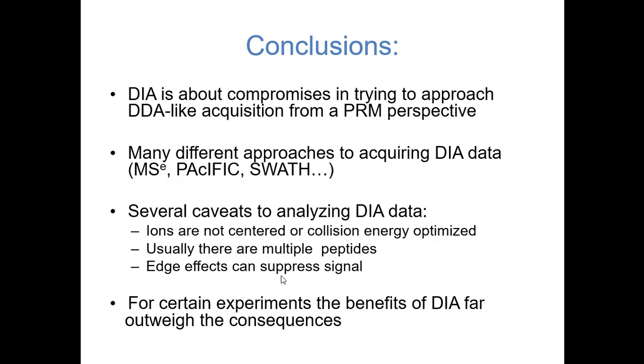Some of them are going to be highly abundant and skew in one direction. But in that 2 m/z wide space, I guarantee there are hundreds of low abundant peptides that are just below your threshold. All of those low abundant peptides produce the same reporter ions, and so you get what we think of as saturation or interference, but really all those low abundant peptides are producing the same reporter ions, and they all average out to 1 to 1 to 1 to 1 to 1, which is why we get compression with iTRAQ.